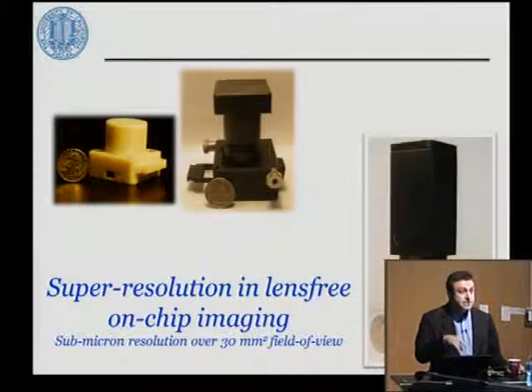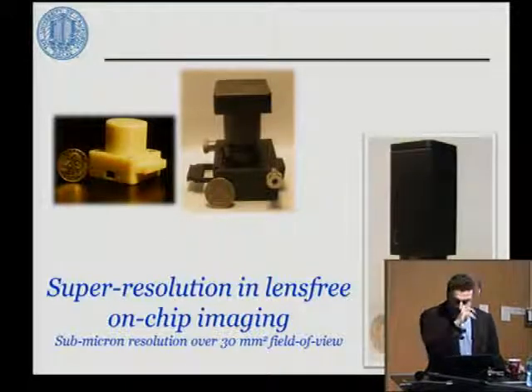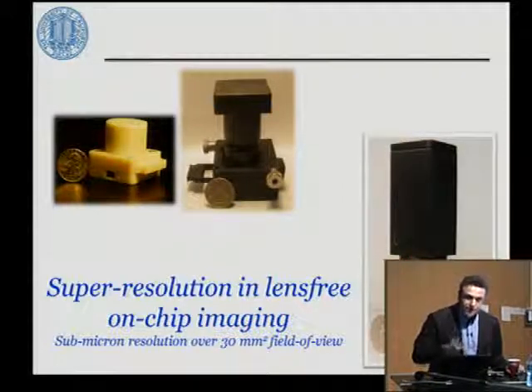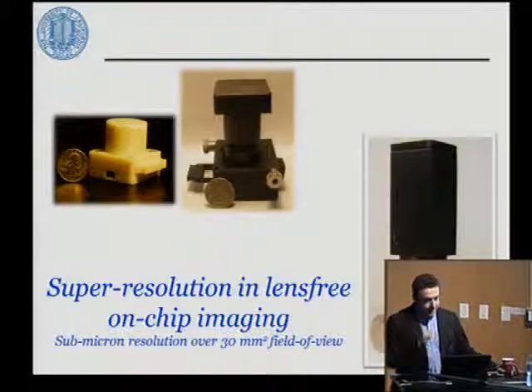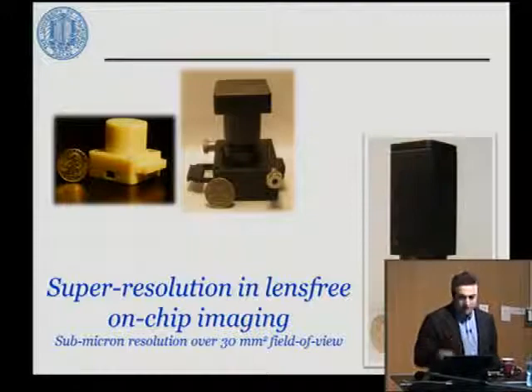So in that regard, this is still diffraction limited imaging in the sense that we're not bringing evanescent wave information here. We're strictly working with traveling spatial frequencies, not evanescent. And the resolution enhancement here is through eliminating pixelation.